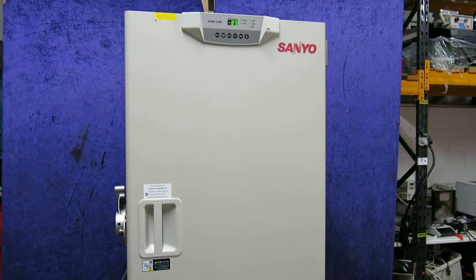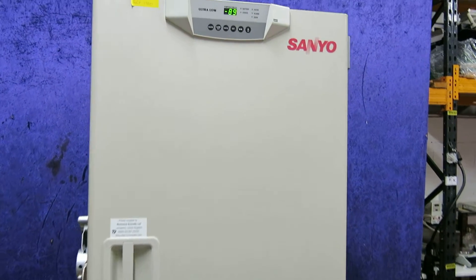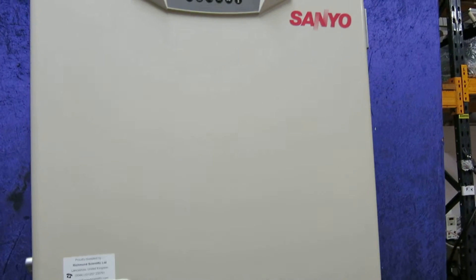This is Nick Edmund, Richmond Scientific. He's taking some video here of the Sanyo minus 85 freezer. This is the Sanyo MDF U53V.